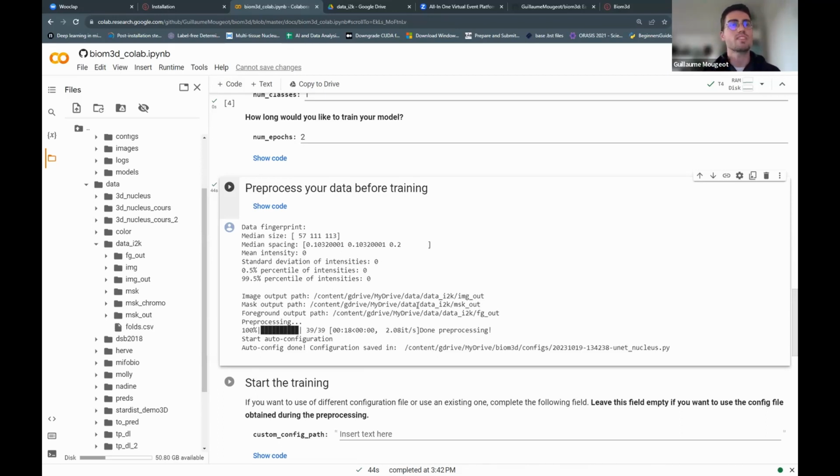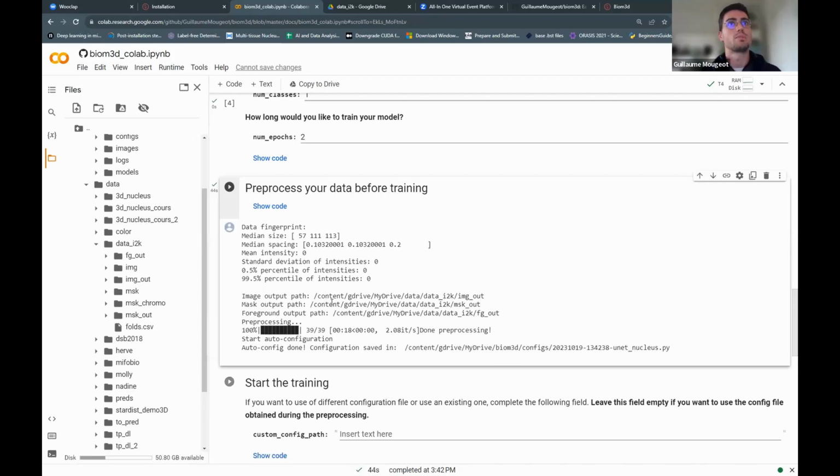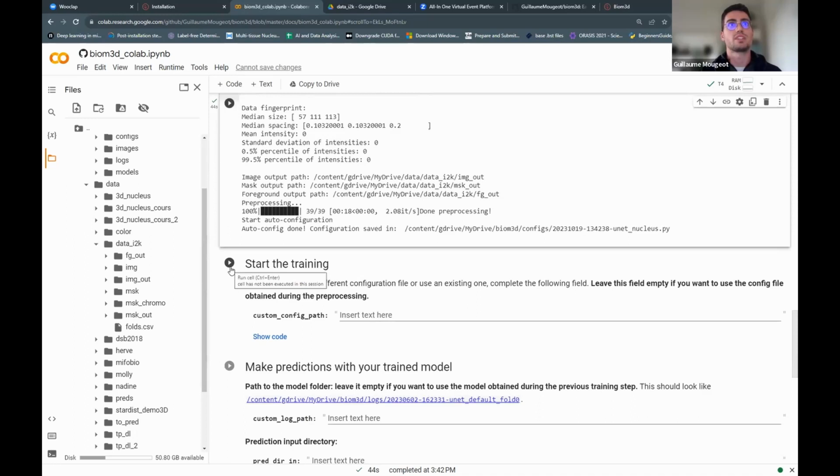So if you have any problem with that, feel free to ask. I'll give you my email in the end. So if you try and you have a problem, just send me an email. And now we can start the training.